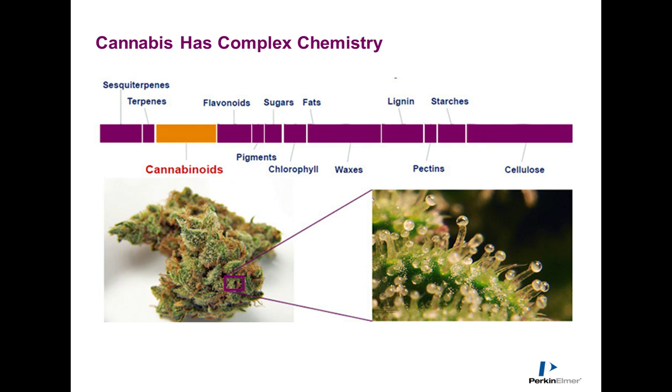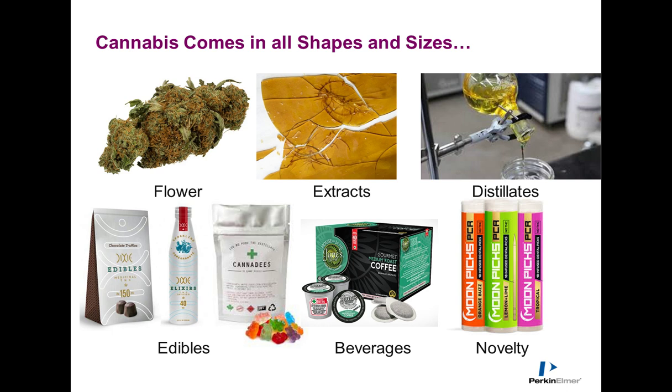And we also see a lot of people characterizing the terpenes of that same plant. These are the volatiles that we'll go into in more detail later. But we also see there's a number of other chemistries, and some of these are very important as well, depending on the product of the cannabis at the end of the processing step. And those products can be very different.